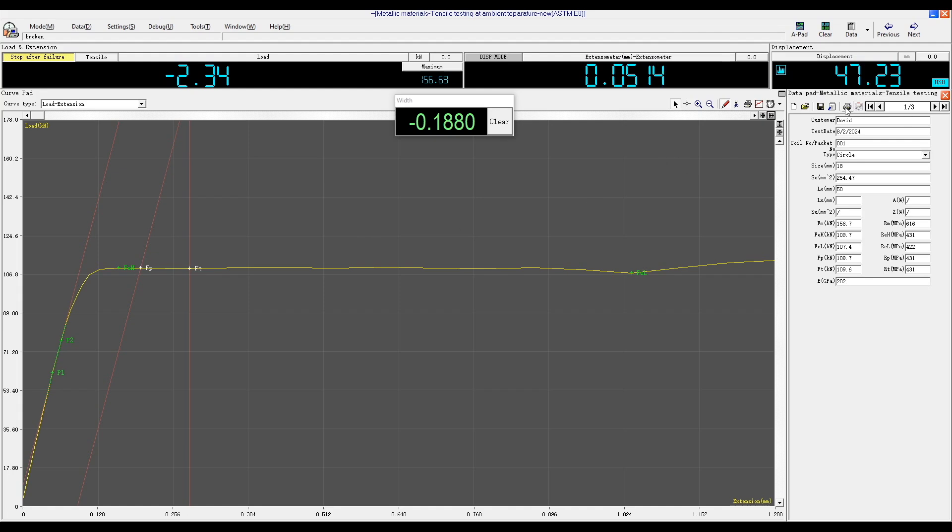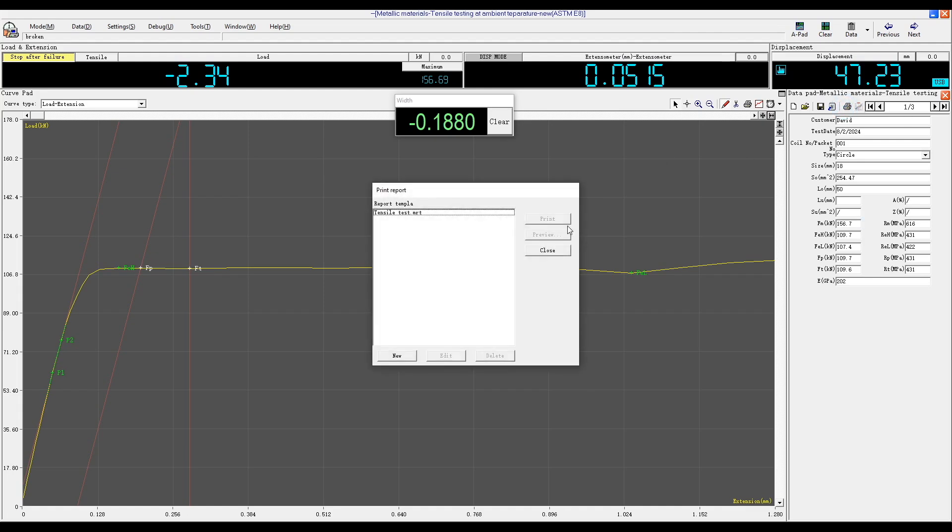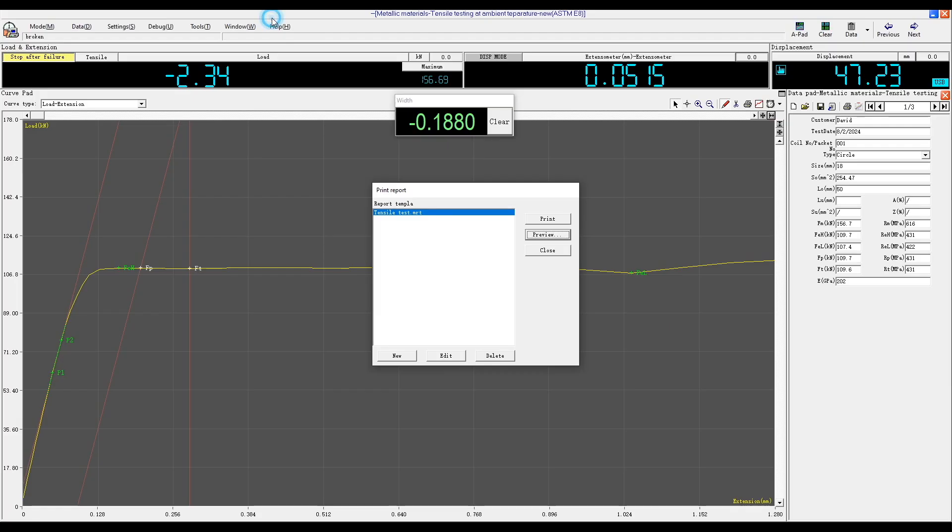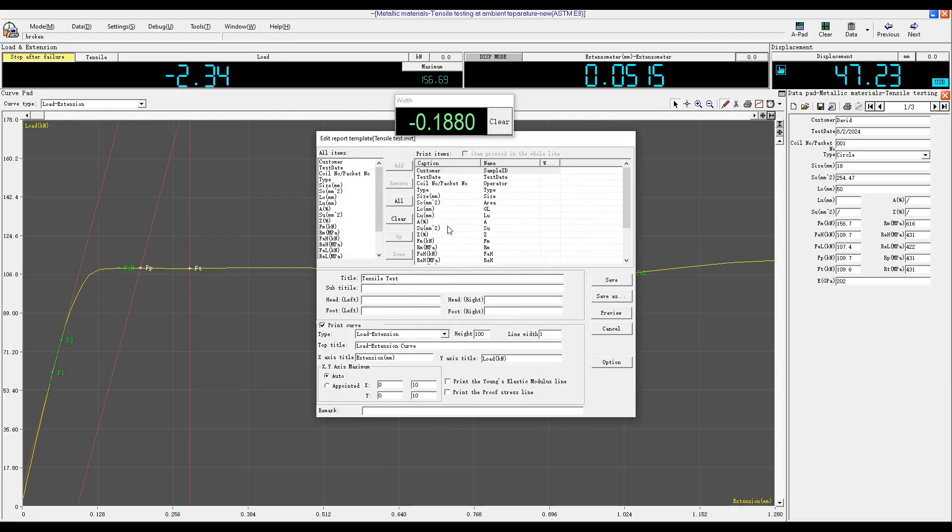Click Print to review the test report for the load extension curve. You can click Edit to choose other curves, such as stress strain curves. Once you have selected your preferred curve, click Save, and then click Preview. Click Setting.